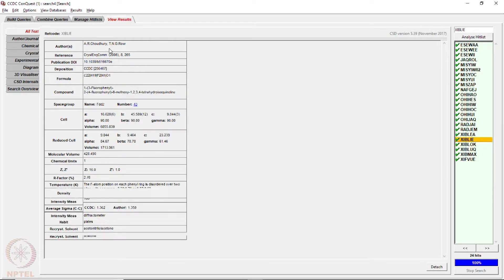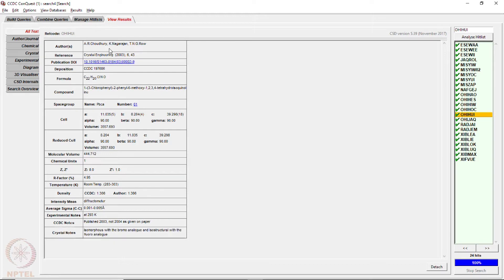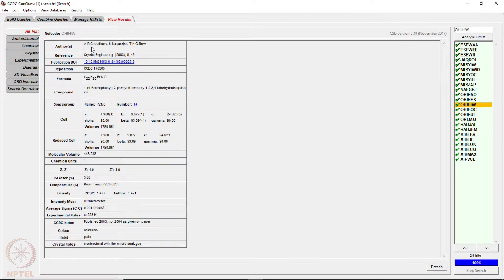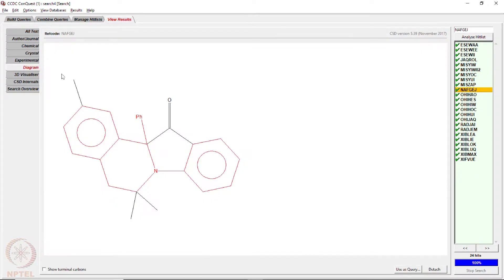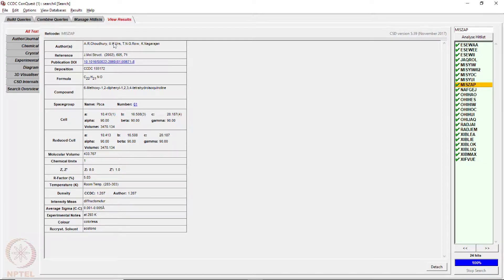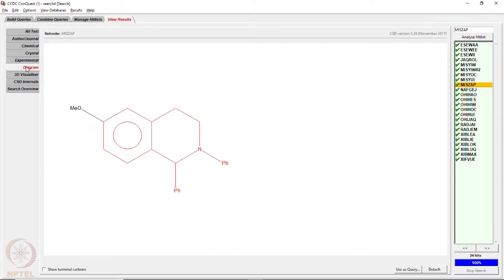You can go through who the authors are — as you can see, these are all from our own research. Most are done by my research group; I worked on them during my PhD. One totally different-looking molecule is from a different group, and the rest are from our group. This becomes very useful in targeting a general molecular skeleton, seeing what is reported in that skeleton, what is not reported, and then deciding which molecules to make.